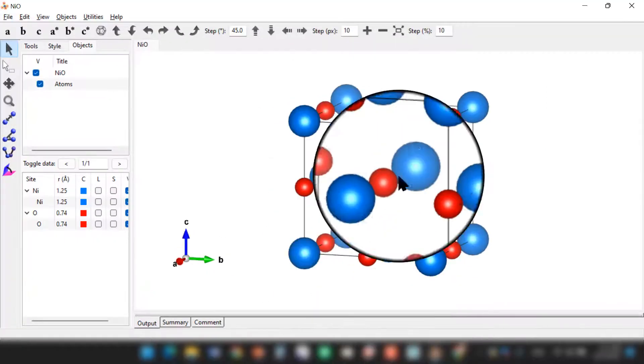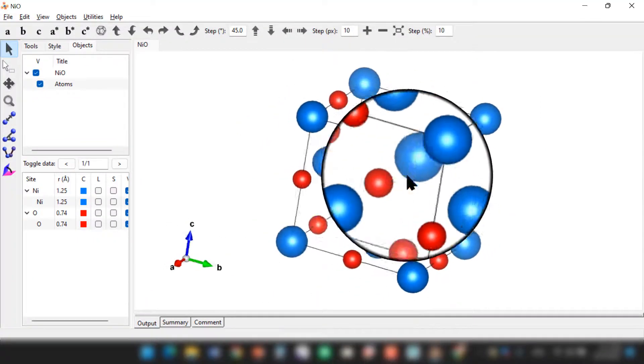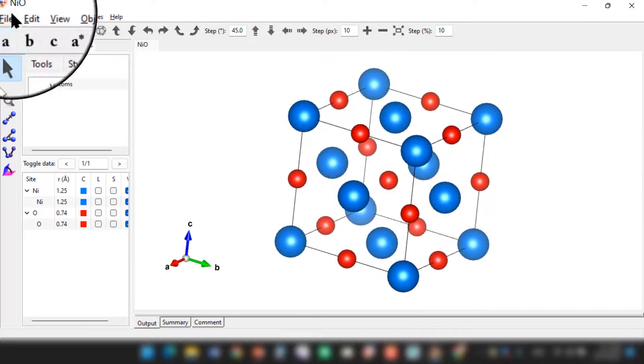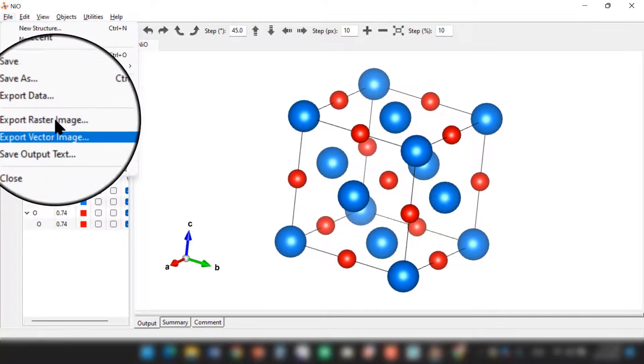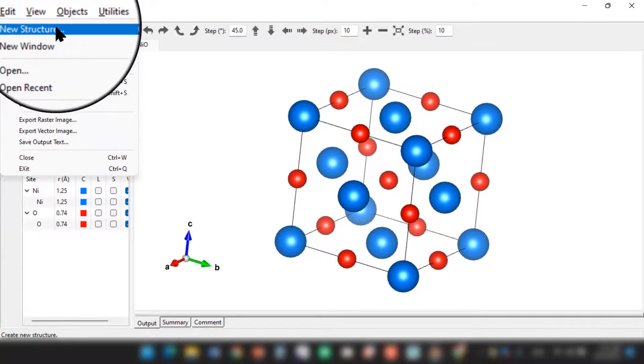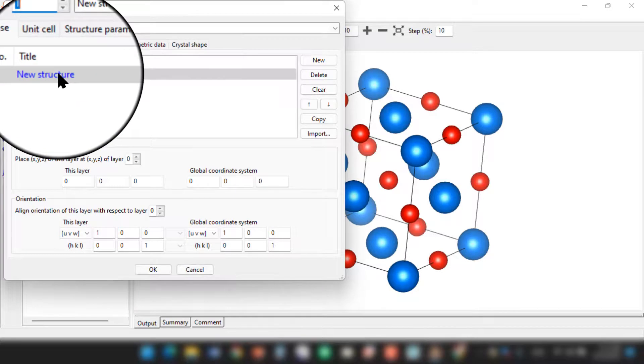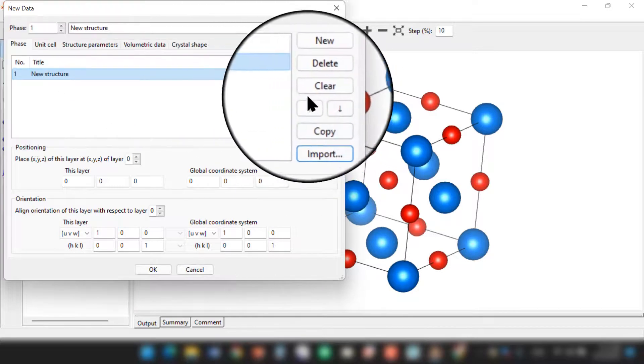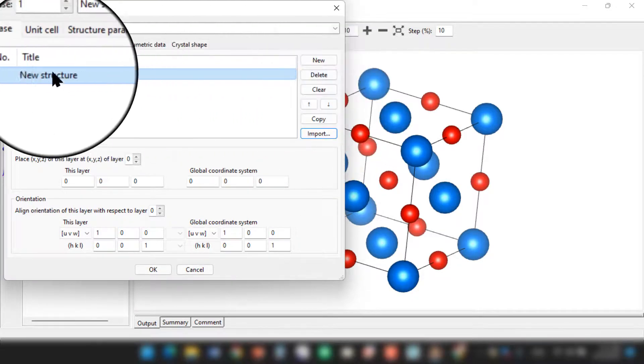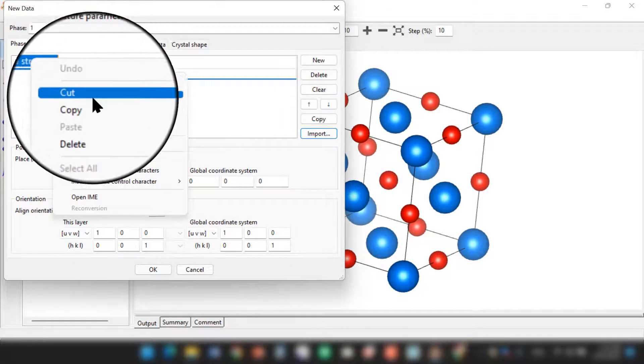First, this is an example of nickel oxide. Go to File, click on New Structure. Here you can give a name to the new structure as nickel oxide.